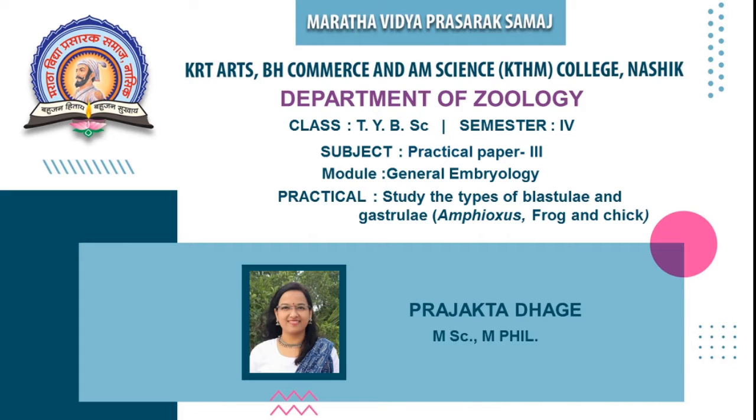Today I'll be taking a practical for class T.Y.B.Sc semester 4. The subject is practical paper 3. The module that we are going to deal with is general embryology, and the name of the practical is studying the types of blastulae and gastrulae. This we'll be studying with respect to Amphioxus, frog and chick.